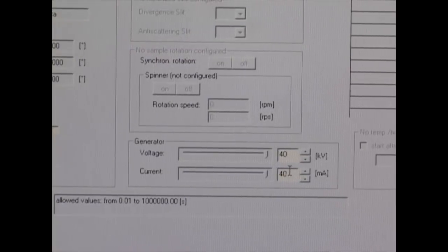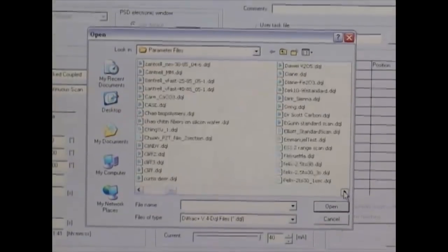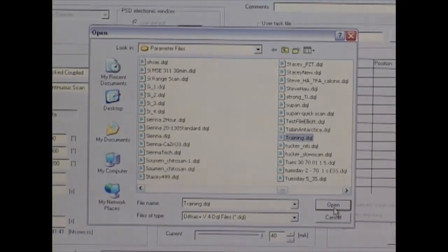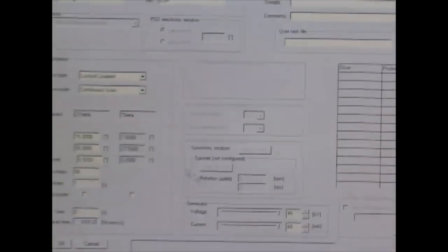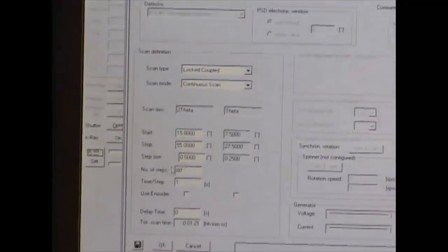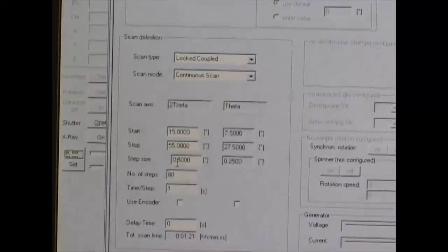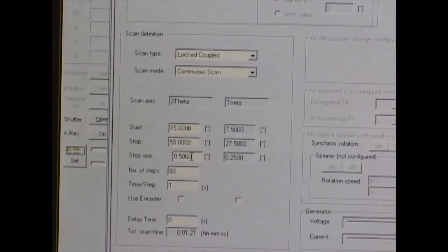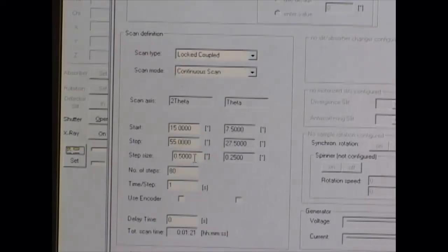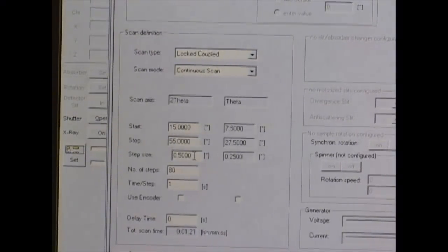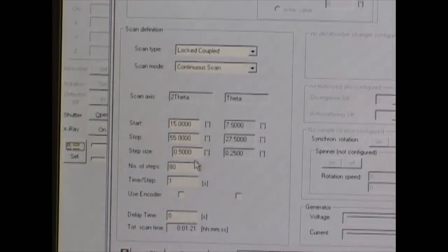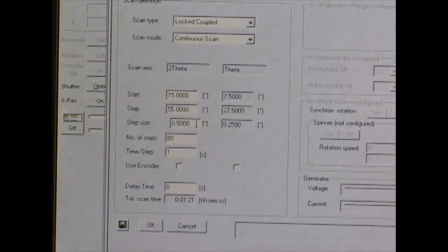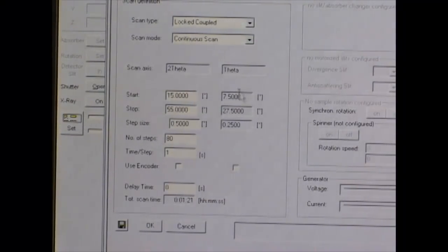If you want to change that, you can do that here. I'm just going to open a file that is for training so you can see what one of those looks like. So this is a very quick scan. I've got it from 15 to 55 and my step size is 0.5. For purposes of demonstration, that's perfectly fine. If I wanted to do any analysis though, that would be unreasonable. Most analysis software need a number of data points for a peak in order to even recognize that the peak exists. So the maximum step size recommended is 0.1, but 0.02 is preferred.